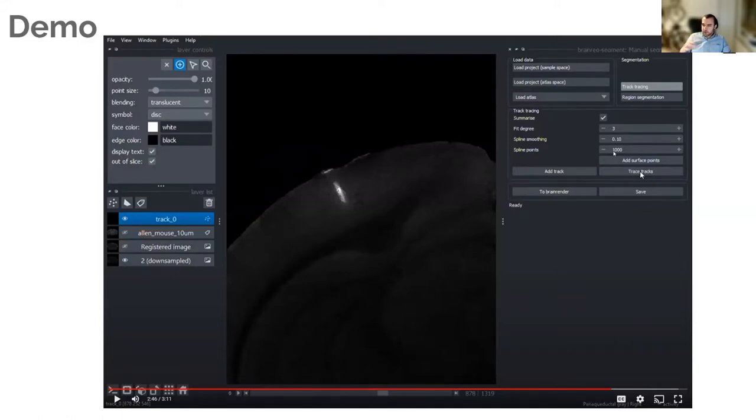This will correspond to how many different points along that track the brain region will get reported at. Because it's a general purpose tool, it's not specific to Neuropixels. If you have a one centimeter track and you want to just report 10 points along it every millimeter, you choose 10 here. If you wanted to do it every micron, you do 10,000.